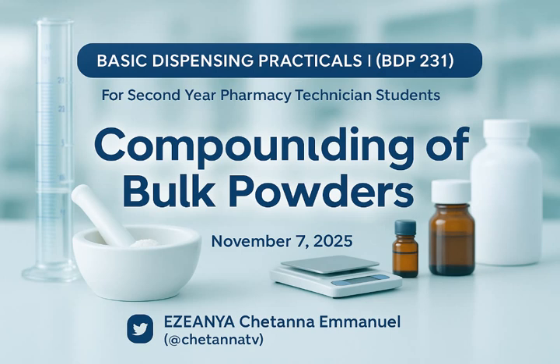But if you see "to", what it means is that you weigh this one, mix, then now use this one to make it up to 500 grams. Is that clear? This exists more in liquid preparation. When we enter liquid preparation, you will appreciate it more. But let me just clean it so I don't confuse you.